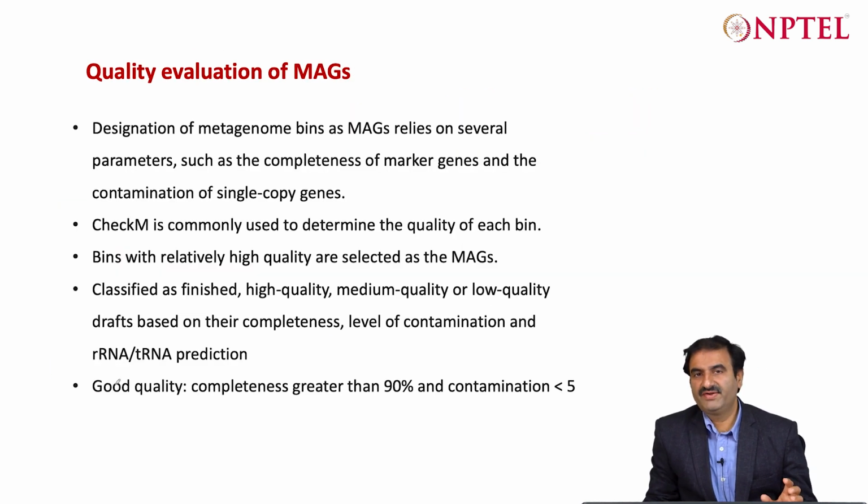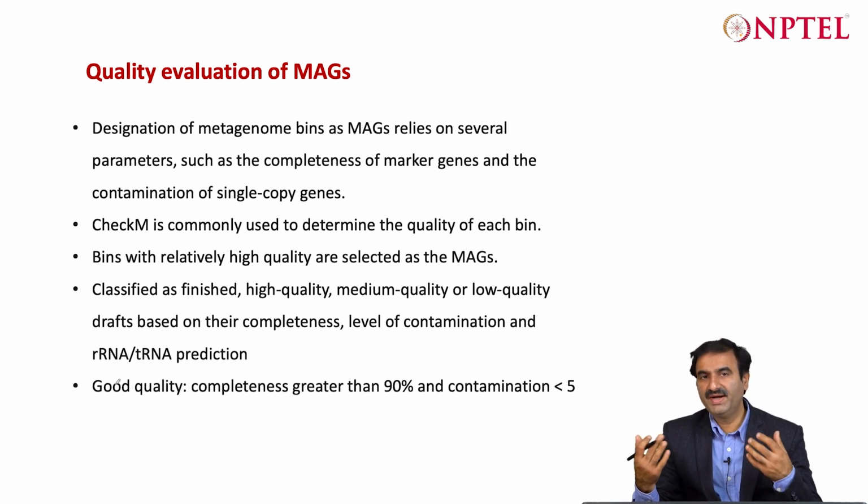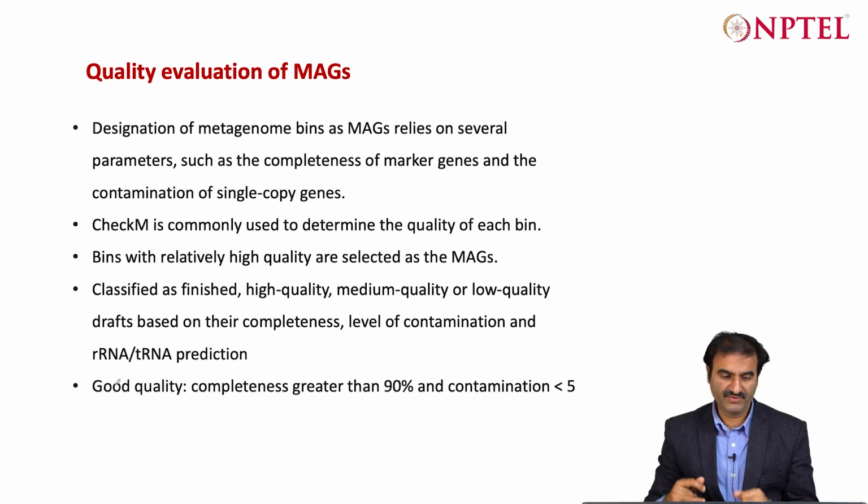Okay, so quality filtration and evaluation means checking whether the MAG or cluster that you have got is complete or not, how complete it is, whether there is contamination, or whether this contig should have gone there, or there could be one gene which could be present in multiple genomes that are highly identical. So you may like to place that contig into multiple of these MAGs. All these things can be resolved, okay.